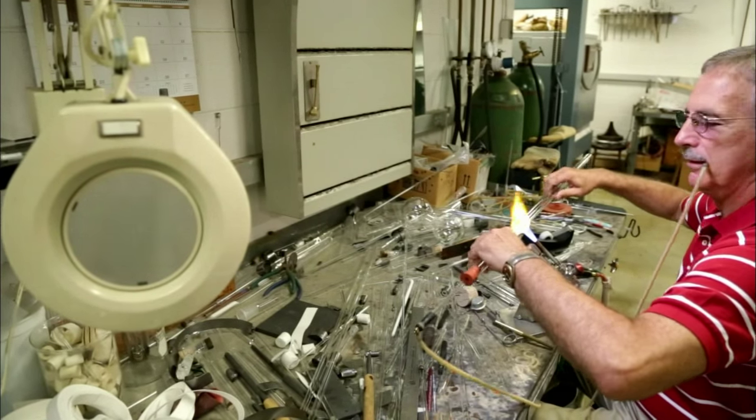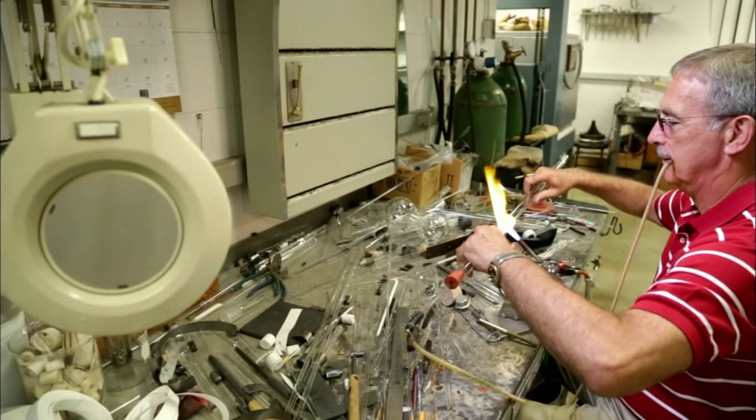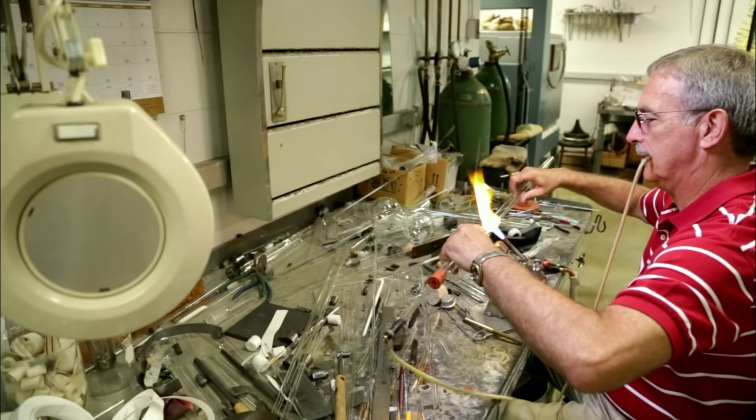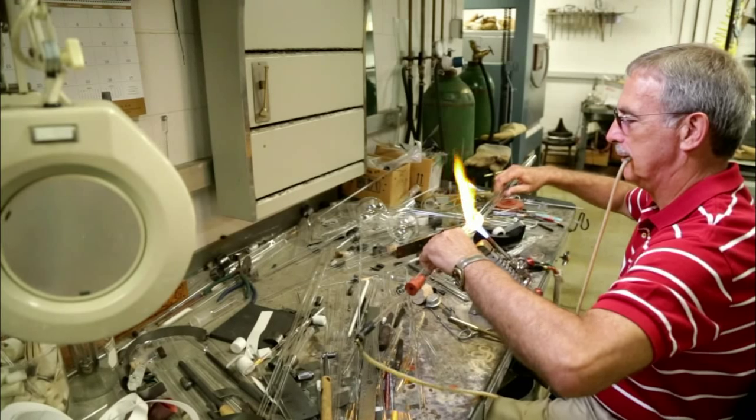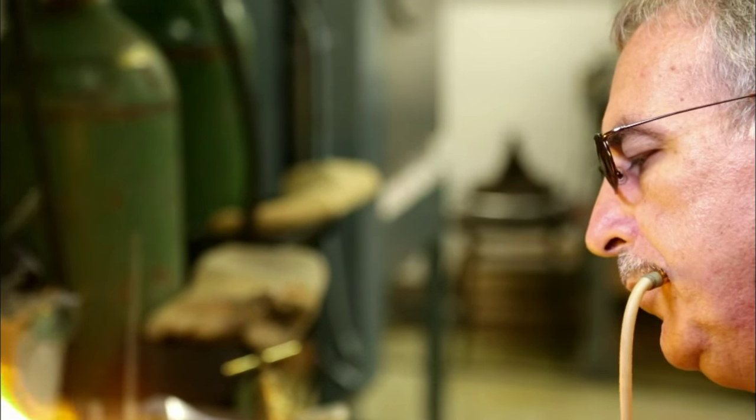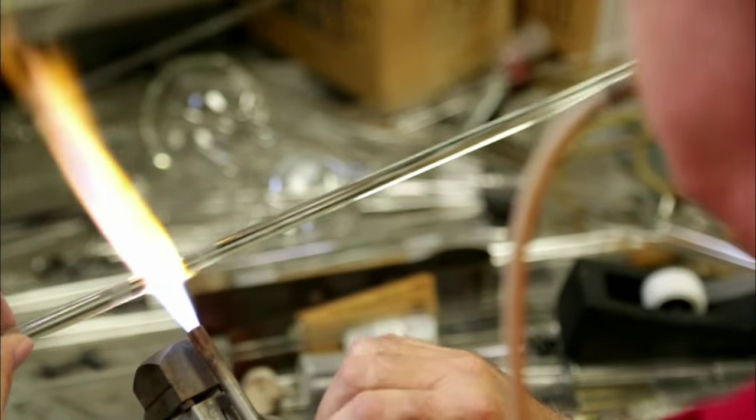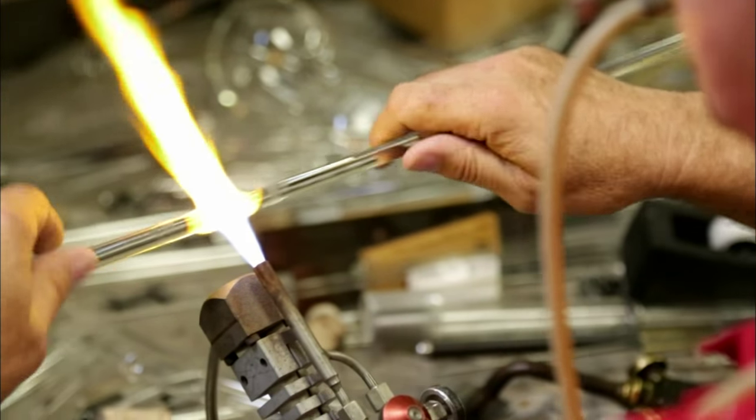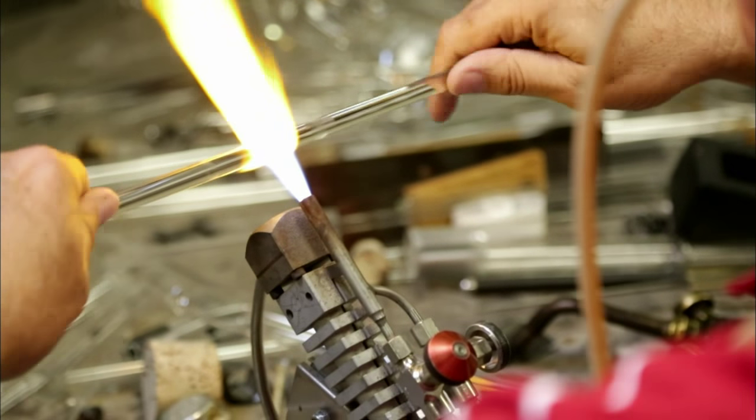The most difficult thing to learn when you're heating a piece of glass is that you have to rotate it because if you don't it's just going to get hot on one side. So to learn to get both hands to turn at the same speed at the same time and then keep it level and straight, it took a little while to master that skill.